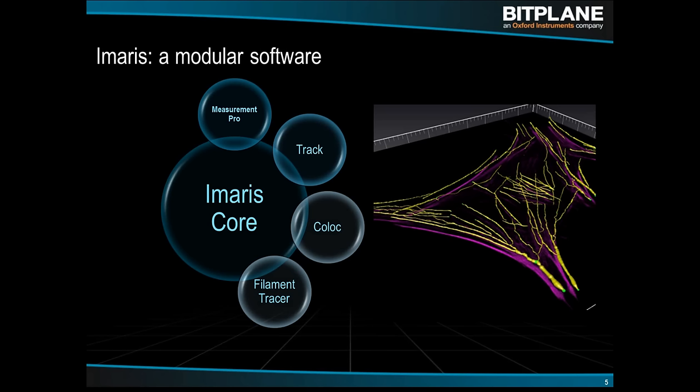features of interest. With Filament Tracer, there are algorithms specific to filament-like objects to help you better represent the object that was imaged in an accurate way, so you get an accurate segmentation and therefore accurate measurements. And of course, there are filament-like measurements associated with that, having to do with the length of each segment and the number of branching points and the sizes of the branching points and their distance from a beginning point, volume and so on, density of spines attached, etc. So those are all of your filament-specific measurements and many more that would be added.